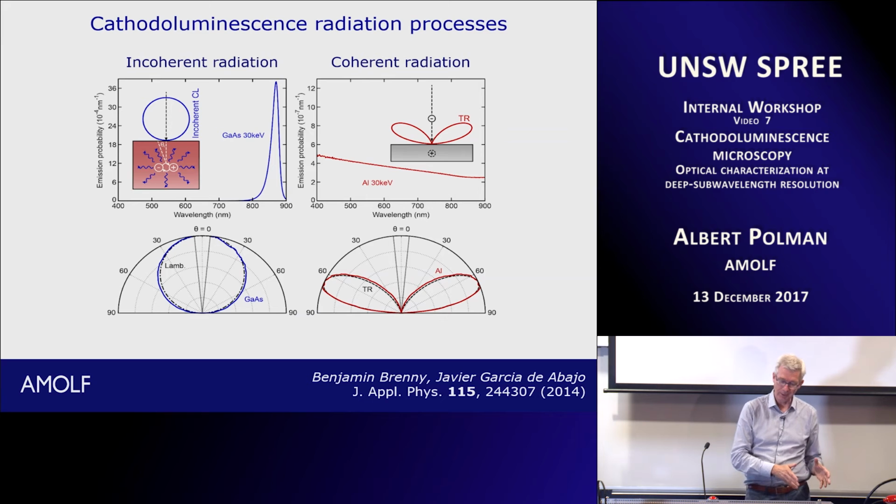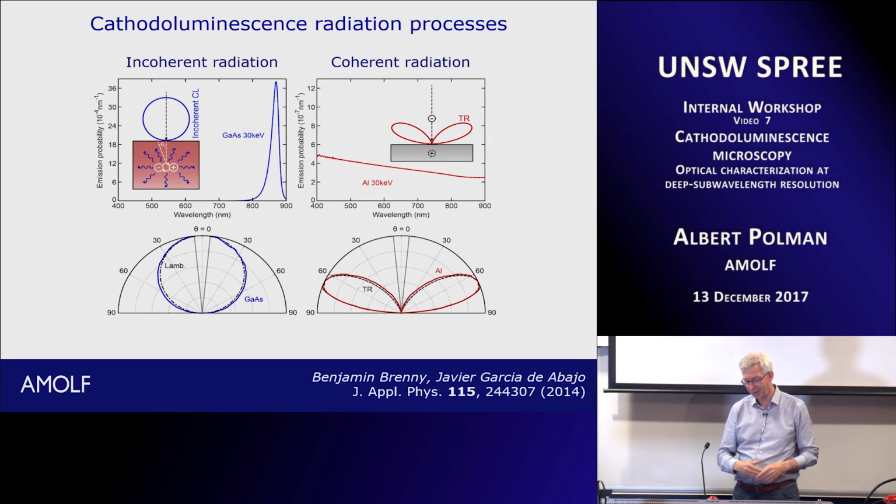Now, in the incoherent radiation, you have to solve Schrödinger's equations because it deals with electrons and electron holes and potentials and band structure. Can't be done, right? In very simple systems, we know how to calculate band structure, but to calculate how CL is generated and how efficient it is is impossible. But it's okay, we can use it as a tool.